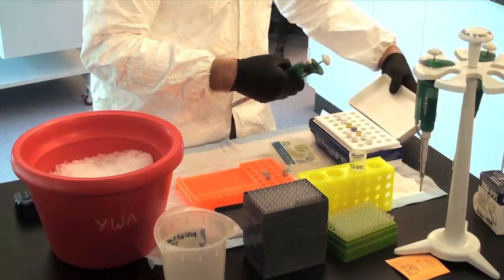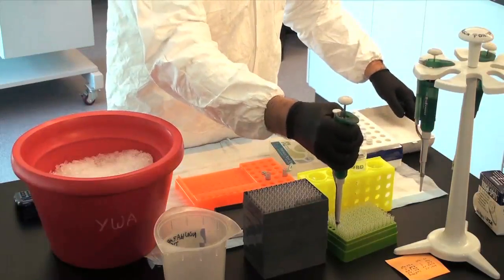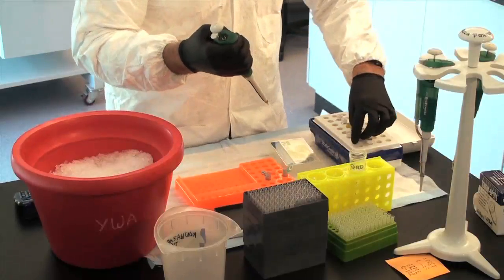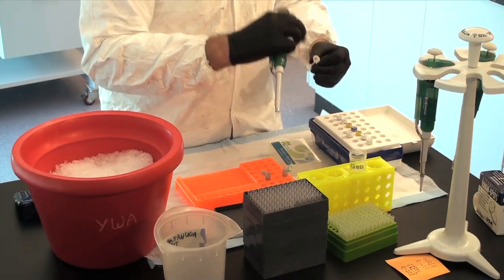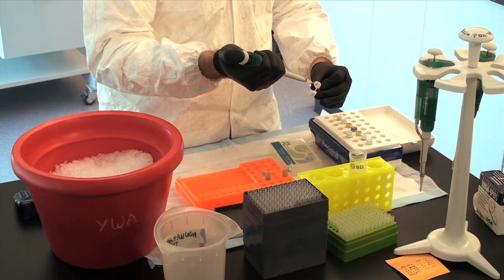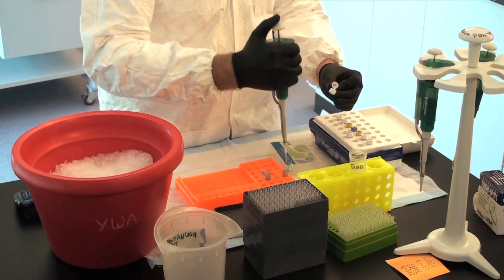Step 4: Add 4 units of each restriction enzyme. One unit is defined as the amount of enzyme necessary to digest 1 microgram of DNA in 1 hour. For this reaction, we will digest 2 micrograms in 1 half hour.